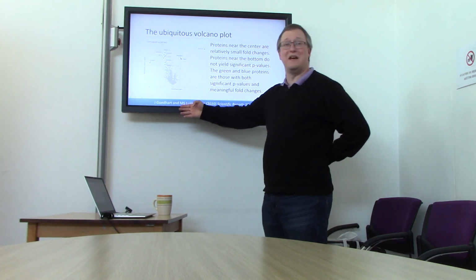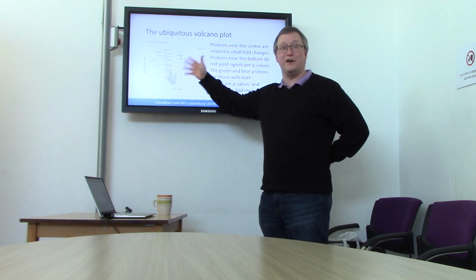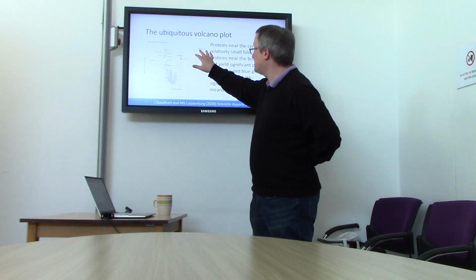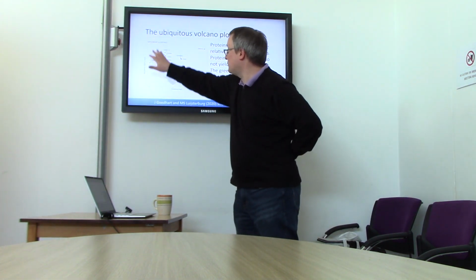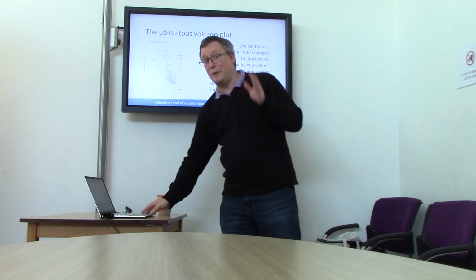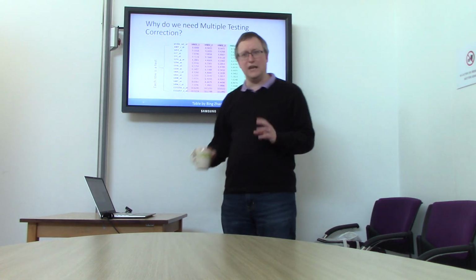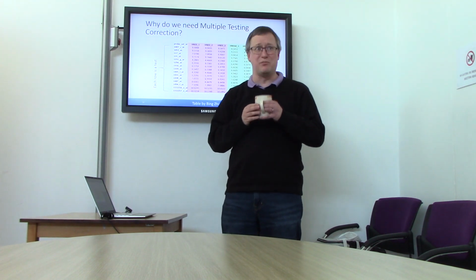So a very interesting paper. They put forward some software that you can use to make your very own volcano plots. It's pretty cool stuff. So the proteins here are up in cases. These are proteins that are up in controls. This is a useful way to separate it out. These show up everywhere, so it's good to know about them. Now, I cannot give a lecture on this topic without discussing multiple testing correction because it's really important.